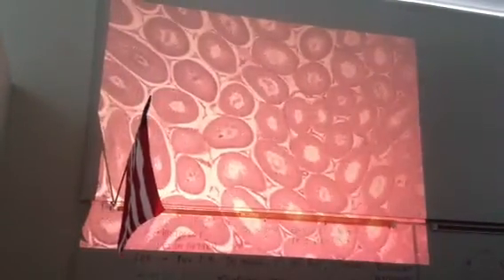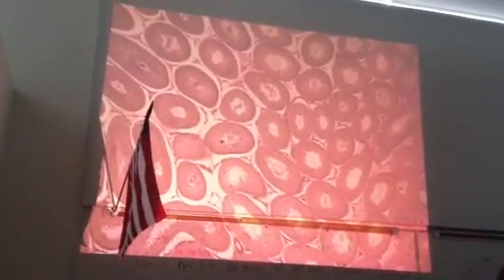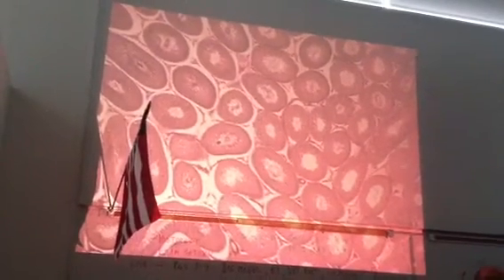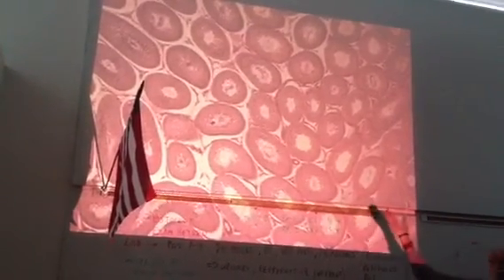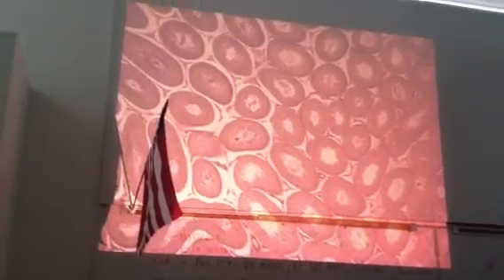So the tube we see here is a single tube sitting in one little compartment. It's called the seminiferous tubule, and it's very, very long. What it does is it winds back and forth and back and forth in the compartment. And when you cut it, it looks like there's a whole bunch of tubes there, but it's all a single tube, and that's where sperm cells will be formed. So that's the seminiferous tubule within the testes.